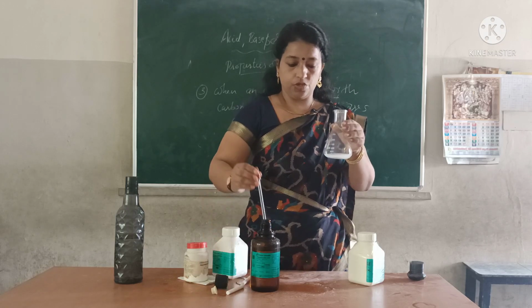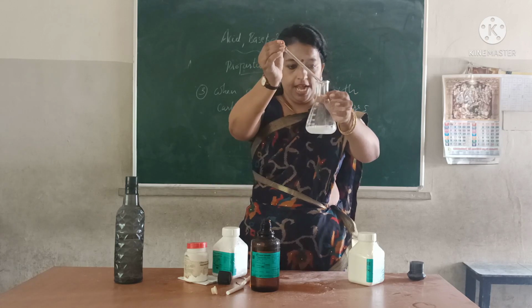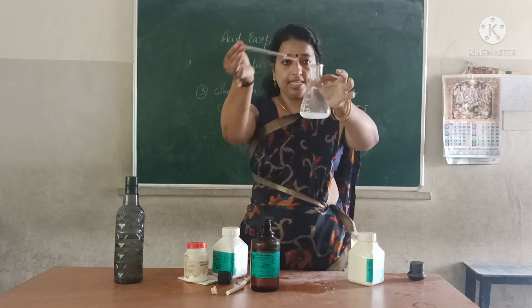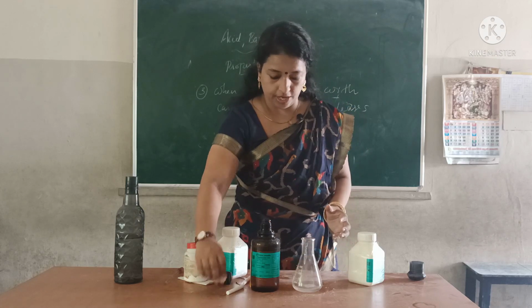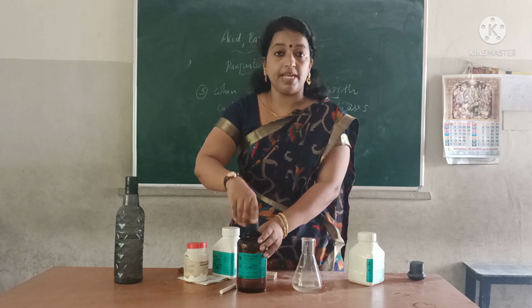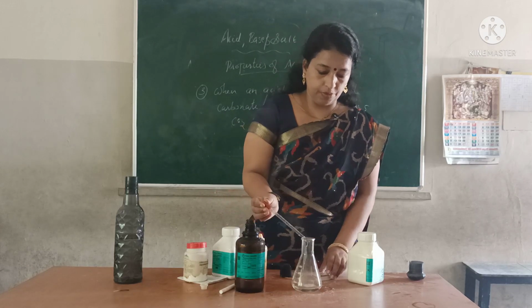Right? So this is sodium carbonate solution. What am I pouring? Hydrochloric acid. You can see that the gases are coming out. Can you see the gases? It's a very fast reaction actually. The reaction between sodium carbonate and acid is a very fast reaction. So I am pouring some HCl.